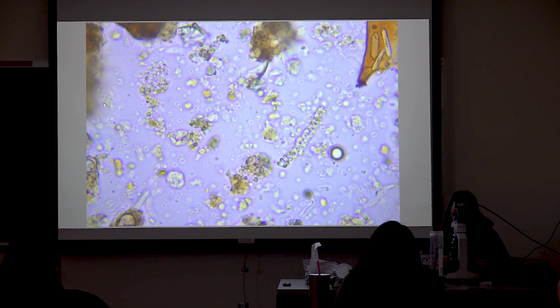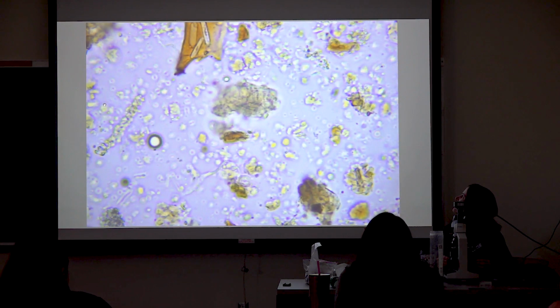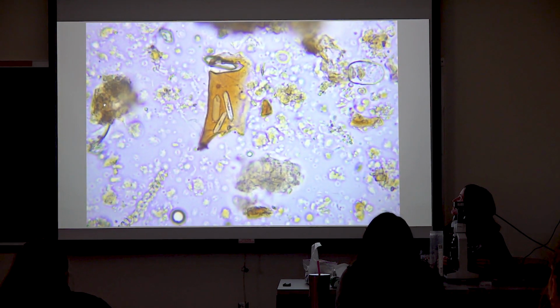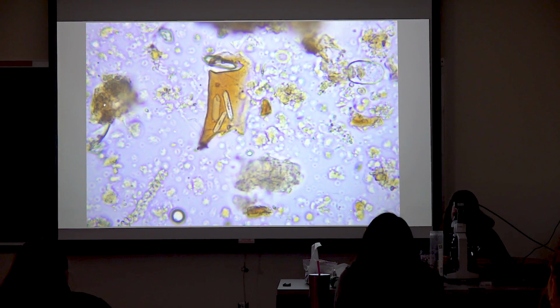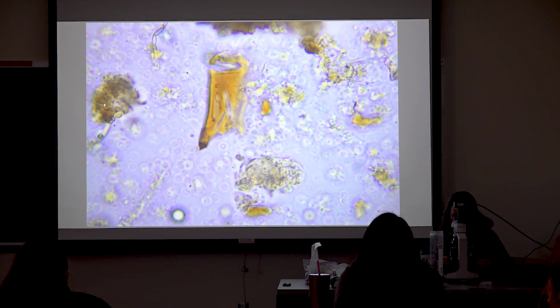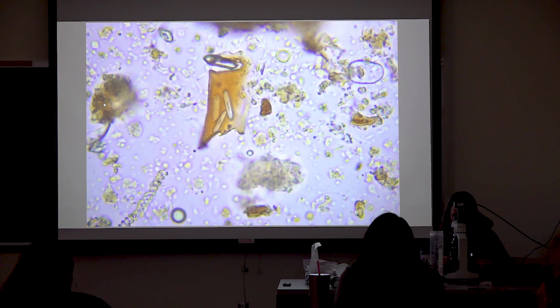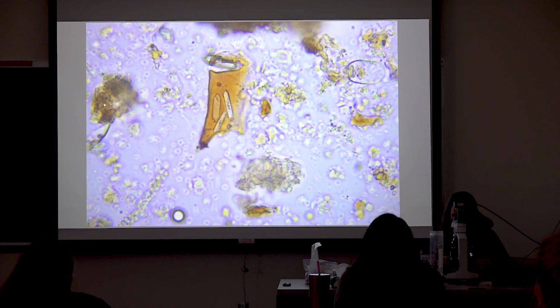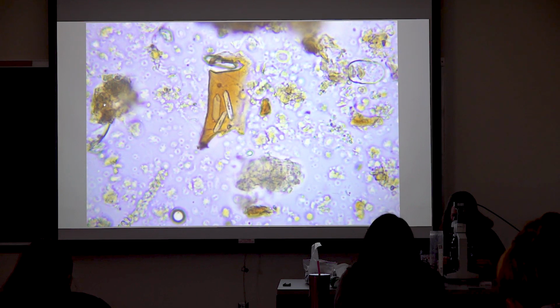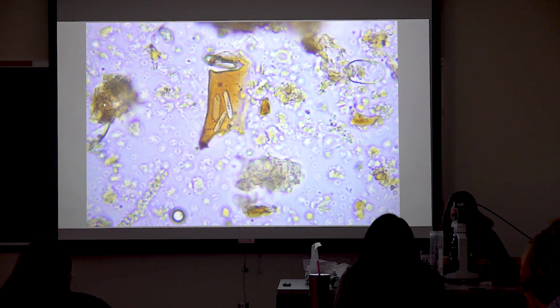In the upper right-hand corner right there, on that golden surface, we have some. What is that? Well, with those sharp points going on, there's clearly some crystallization going on, so you will see a lot of that too. Different salts and things can form different crystal structures under certain conditions. So likely it's mineral.